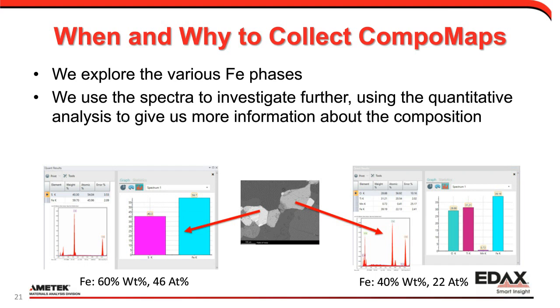And that's because of various factors like your ionization, your kV, your overvoltage, all of the things that you learn about in an EDS training class. But the key is that you really can't interpret a spectrum based on peak intensity alone. You have to do those matrix corrections, those ZAF corrections, to be able to really understand the true nature of the material. So when we do this, we can pull out the two phases of interest, which the arrows are pointing to.